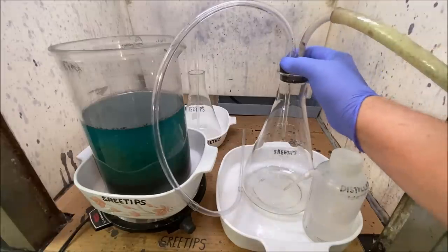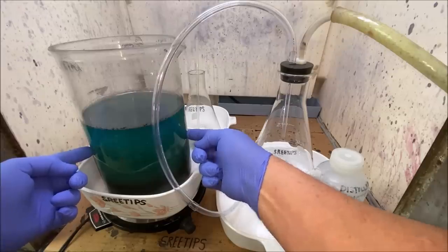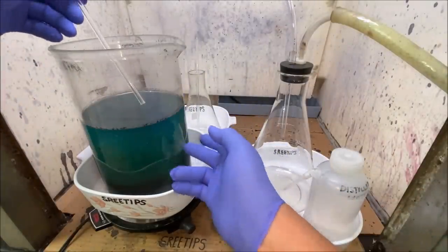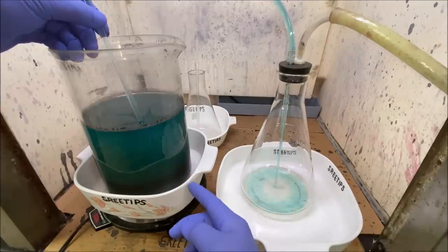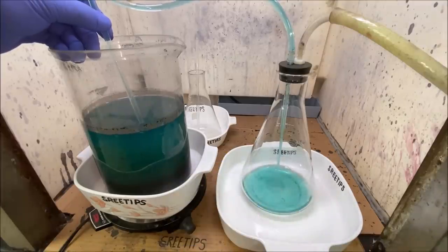I've got my vacuum bottle hooked up here. This has been allowed to settle for 2 days. And now what we're going to do is vacuum off the solution in here into our vacuum bottle. We're doing it this way so we don't disturb these solids that are settled out down on the bottom of this beaker.